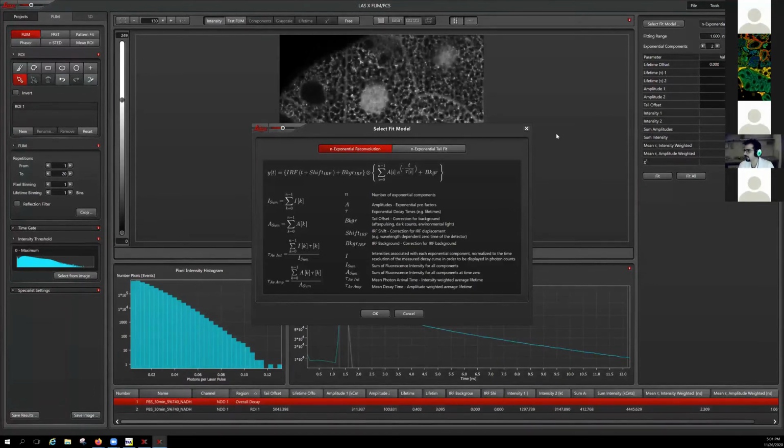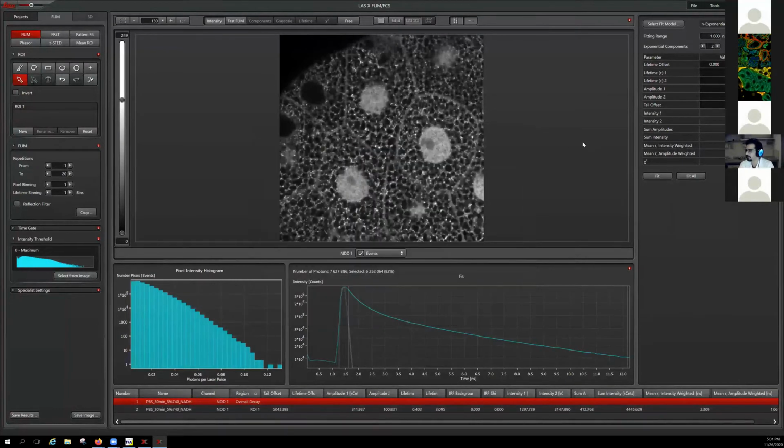And just something which came up during the discussion was the question about the intensity and amplitude. So I can shortly talk about that. So just switch off the detectors, increasing the light. So I will be back.